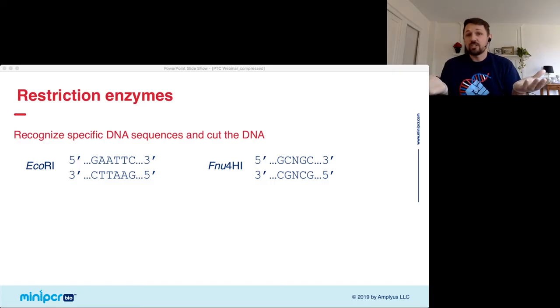You may say, why don't we just sequence it? Today, it is the era of sequencing. We could do that, but you probably can't do that in a high school very easily. Sequencing has gotten very cheap and easy, but it's not quite that cheap and easy yet. So we're going to use a technique called restriction digest. It's a classic genotyping technique that's been used for decades. I used it a ton when I was in graduate school, and people still use it today.